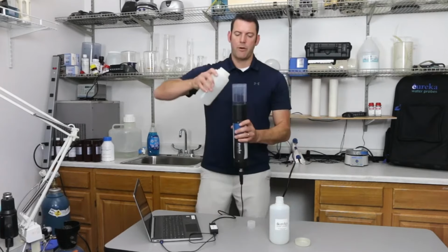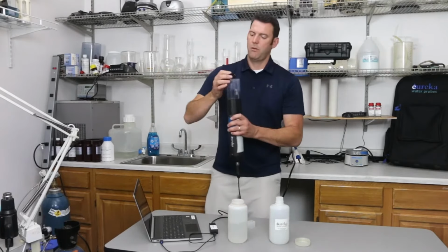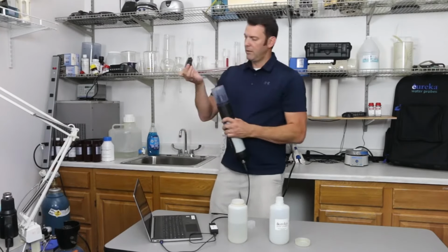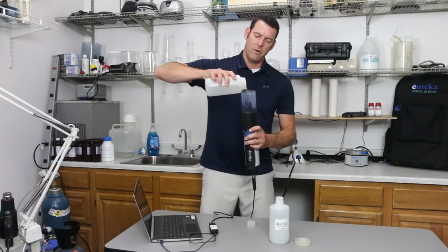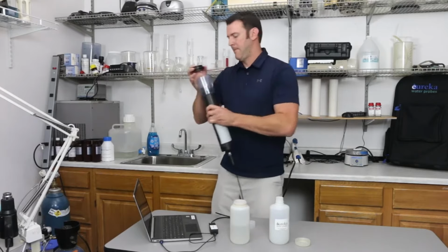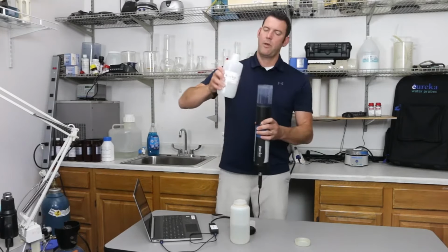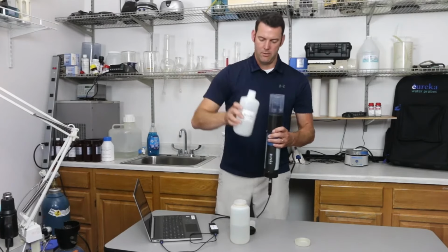This is my DI water. The rinse here. You can use the lid to keep it from sloshing around. All right, one more with DI. Throw that out. Now we have our Turbidity 600 NTU solution.